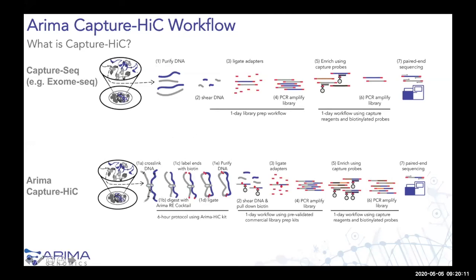So in fact, it's the exact same Hi-C protocol that you would do for genome-wide Hi-C, except right before you would traditionally sequence, you add your biotinylated probes and enrich for any sequence element that you're interested in probing for the 3D landscape. If you want to capture promoters and all of the distal elements that interact with them, you would enrich the Hi-C library for promoter sequences.